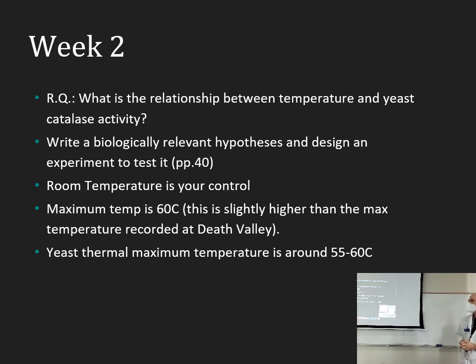The research question basically is, what is the effect of temperature? What is the relationship between temperature and yeast activity? And there's an additional component to that in the manual. I'll paraphrase, it says, and how does that relate to the survivability of yeast in the wild?